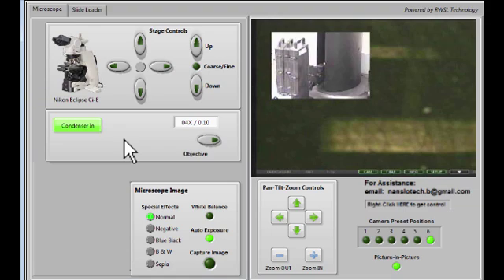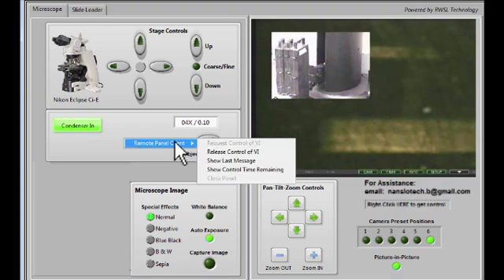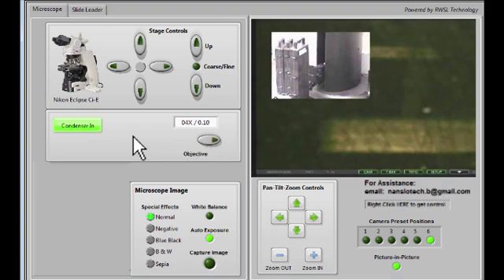When you're finished, or when you want to pass control to a lab partner, right-click anywhere on the screen and select Release Control of VI. Now someone else can take control. Don't forget to call in to the voice conference because otherwise you won't know what your lab partners are doing.